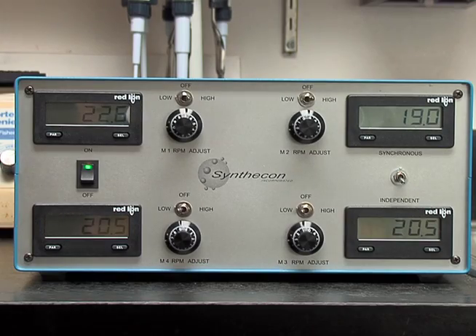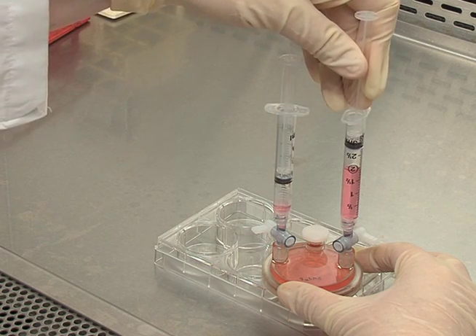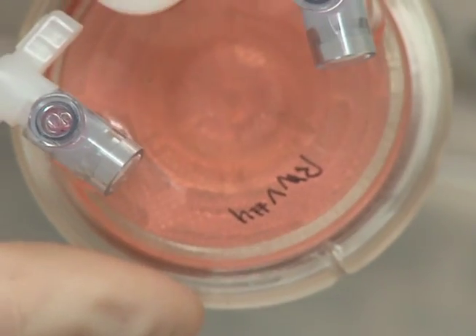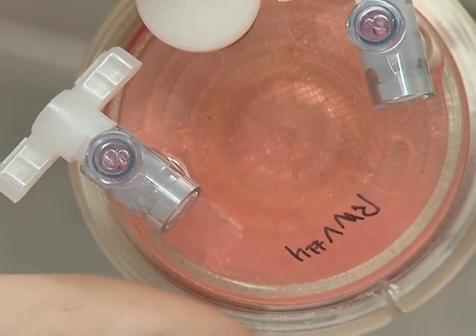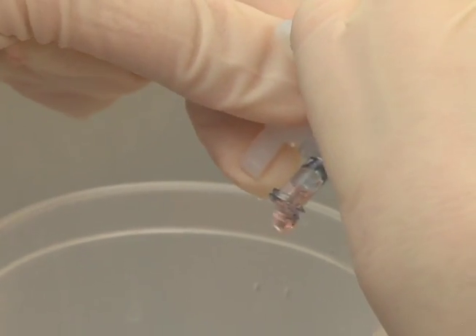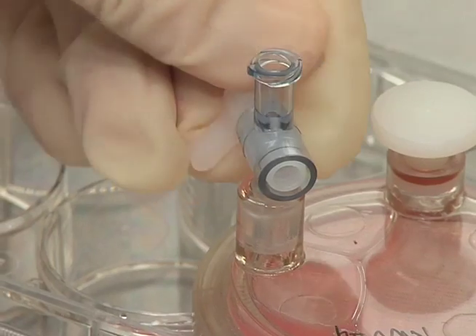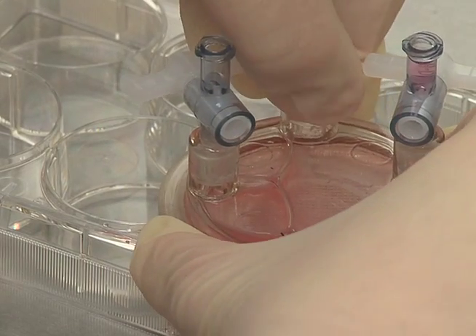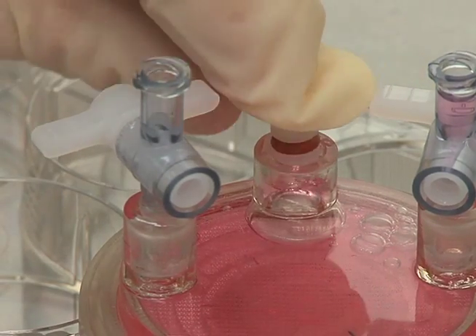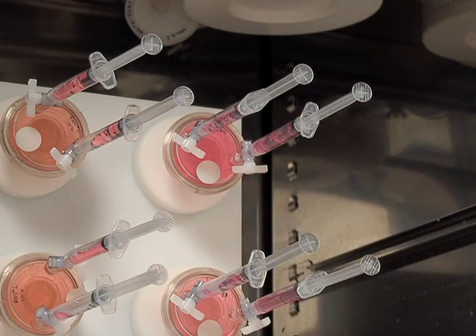To change media, turn off the rotor and remove the RCCS. Pull the pistons up to create some suction, remove the syringes from each small port, and place the RCCS on an angle to allow the beads to settle opposite the large port. Open one of the small valves to release two-thirds of the media from the RCCS into a waste container without disturbing the beads, then close the small valve. Open the large port, add fresh media into the RCCS, replace the stopper, expel all air bubbles as shown earlier, and position the culture onto the rotator in the incubator.